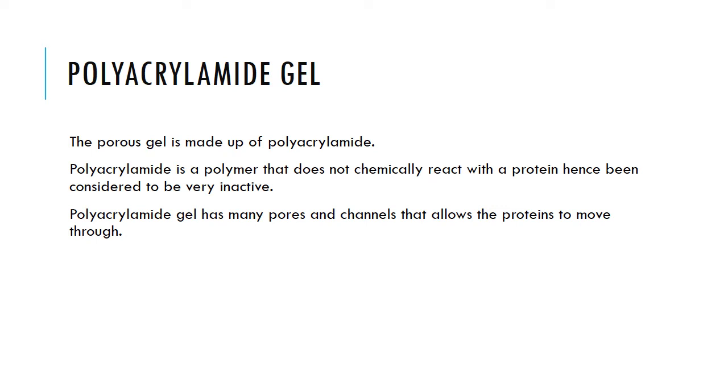the G, which is for gel, and E, electrophoresis. So it will be like this: polyacrylamide gel electrophoresis. So this is our PAGE. Sometimes you'll be seeing PAGE there.